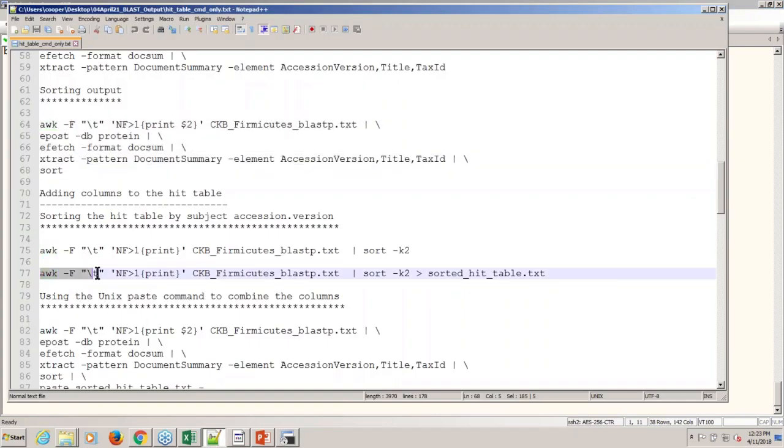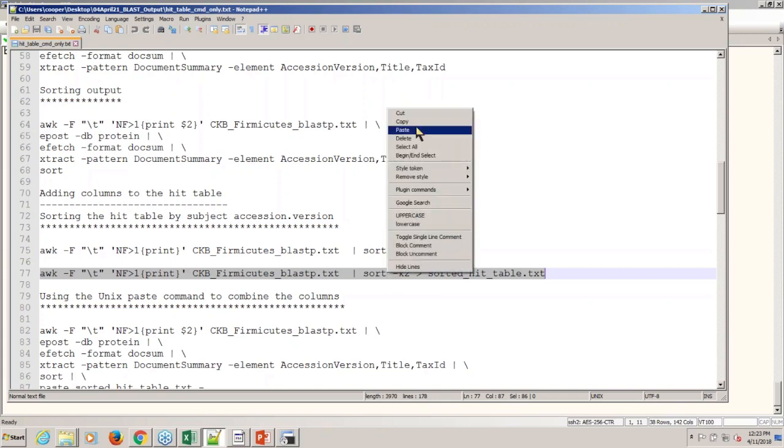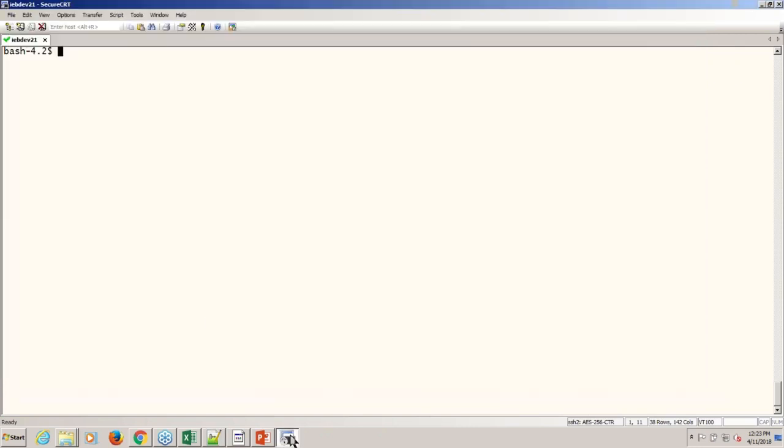And I can save it if I want to. So I'm just going to save that for us. So I'm going to use the redirection output operator there, the greater than sign, to put that into a file. That didn't take long. The reason is because this was local data that I had. Because notice we're just processing the file. We're not doing anything here. And I can just more that if you want.